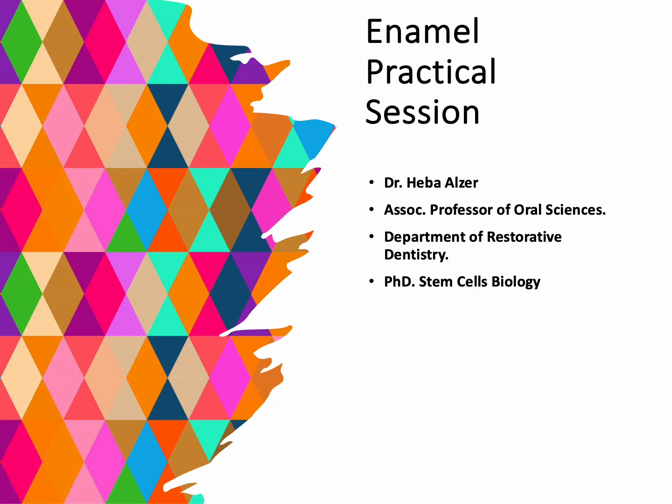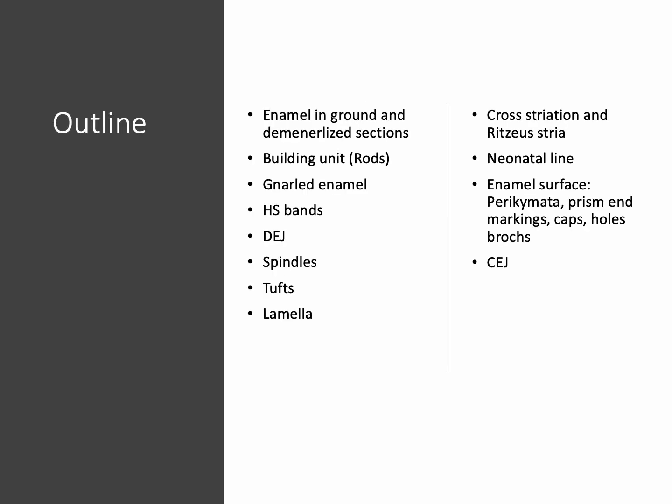Welcome to the last part of this enamel practical session. As you remember, we have our outline. We have discussed all of the outline terms, and we reached the enamel surface, which is composed of all the features we can see on the enamel surface and the cemento-enamel junction.